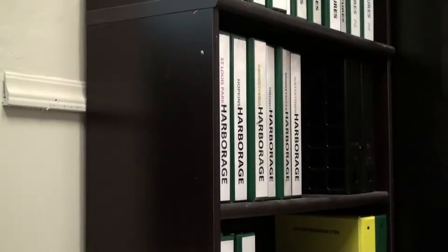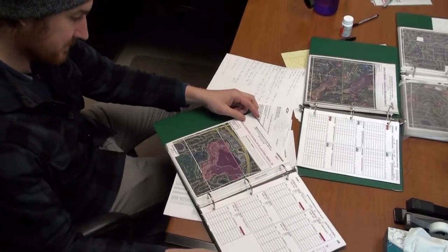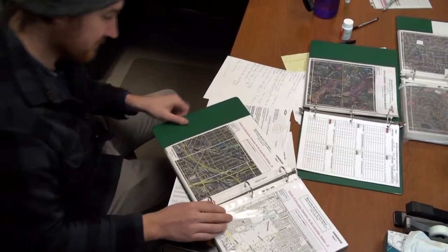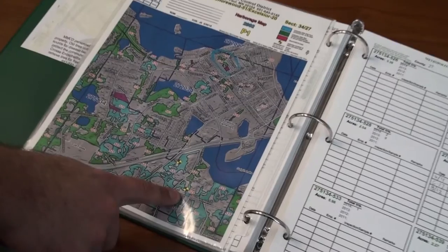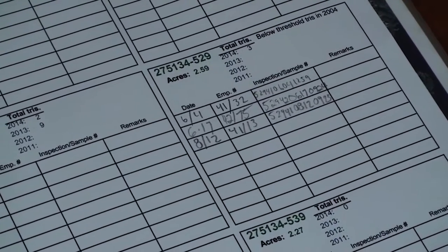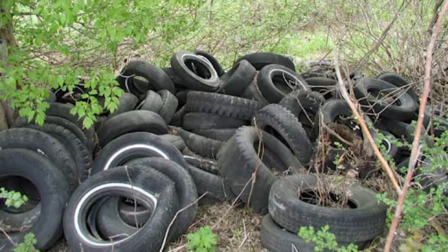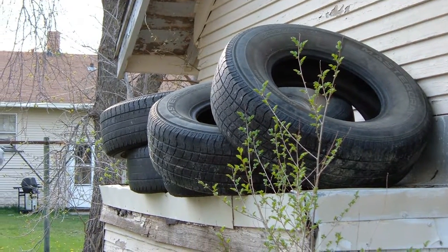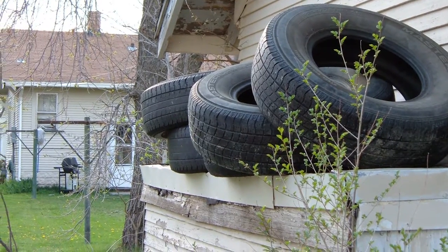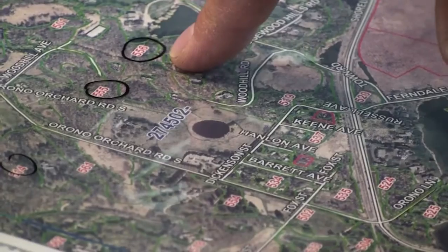Before heading out for a day of Succ-O-Matic surveillance, make a plan for sites to sample. Several criteria should be used for planning. For La Crosse vectors: a history of collecting vector species at a site, length of time since the site was last sampled, or risk factors such as proximity to junk properties or places occupied by children can be used in daily planning. For Culiseta melanura, history of past collections and proximity to bog sites will help direct surveillance.